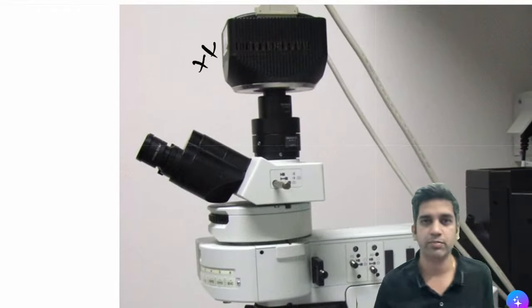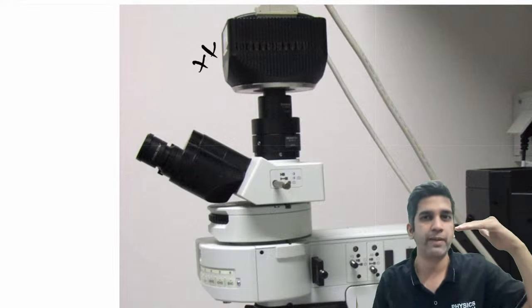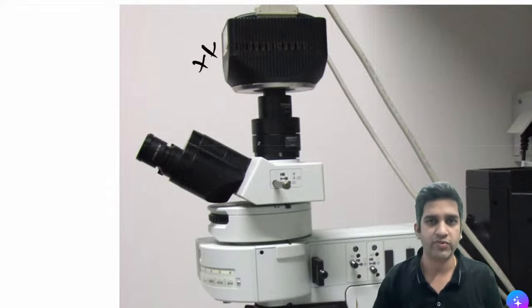Please ignore this. This is a camera setup which can be attached to a normal light microscope also. That is an extra attachment. That's not a part of the fluorescent microscope. I'll have an eyepiece the same way. There's a head which also helps rotate it, like what we saw last time, right?